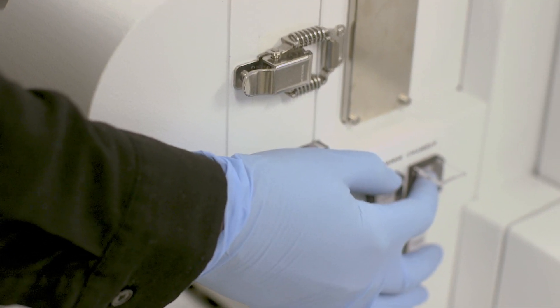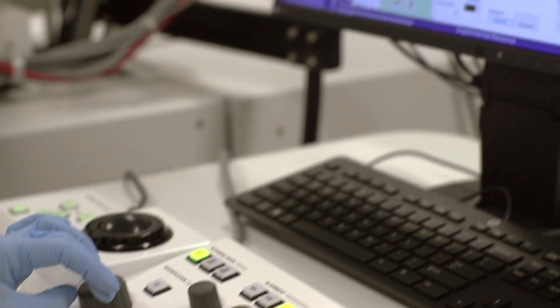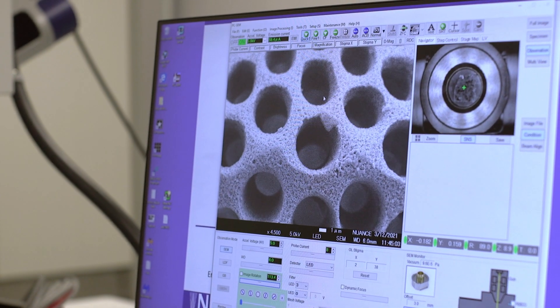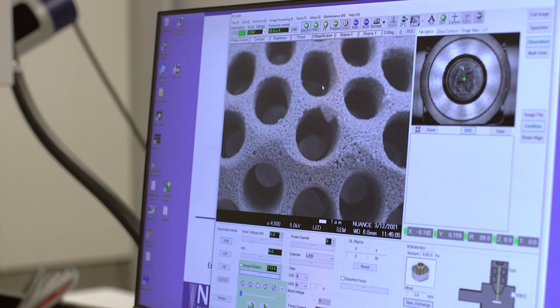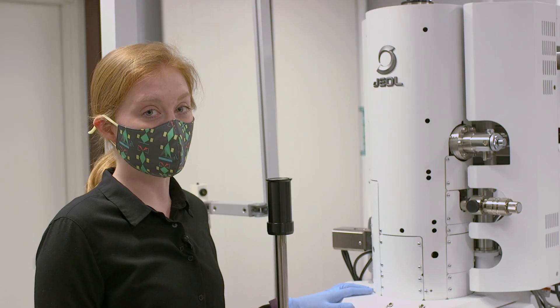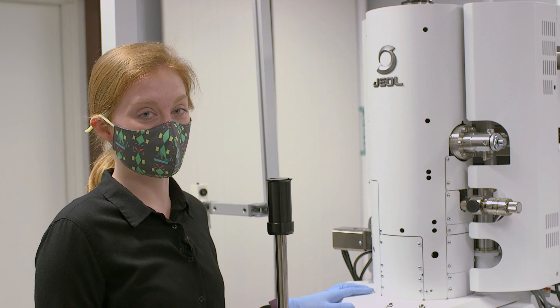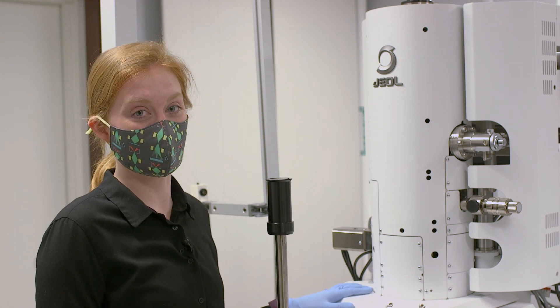A scanning electron microscope can magnify your image up to a million times, which is much larger than what you're probably used to because an iPhone camera can only magnify four to ten times. So this is a lot higher than a cell phone camera.